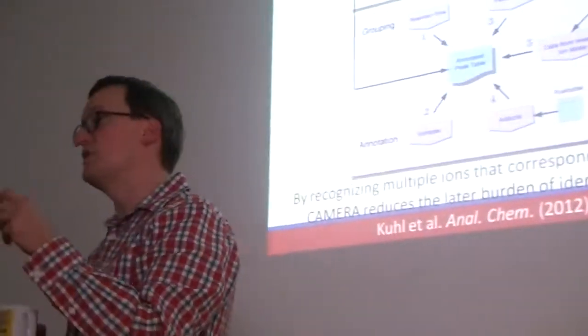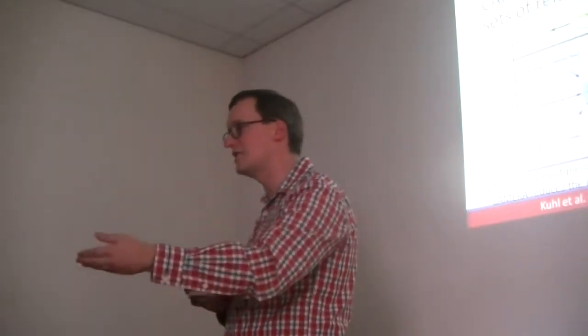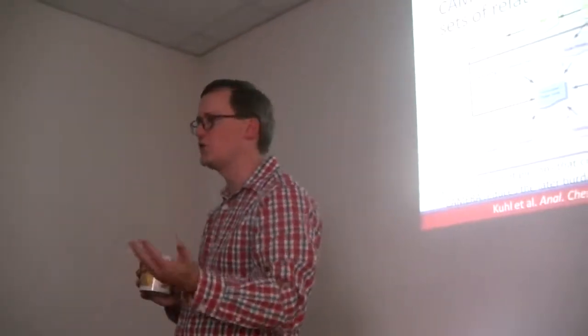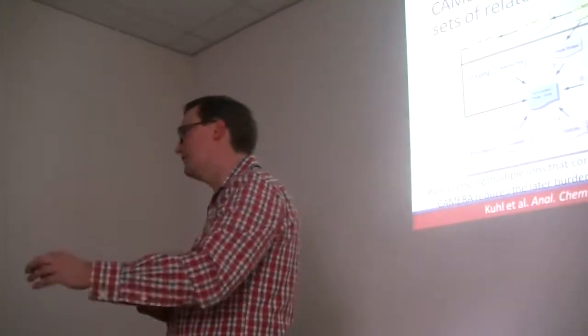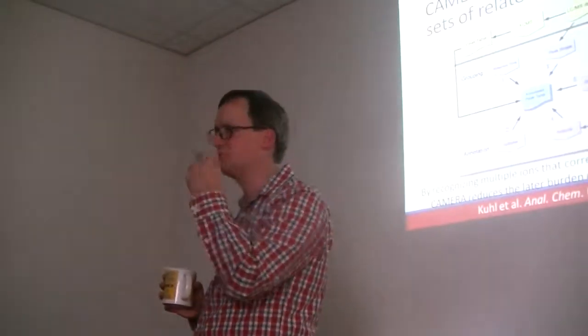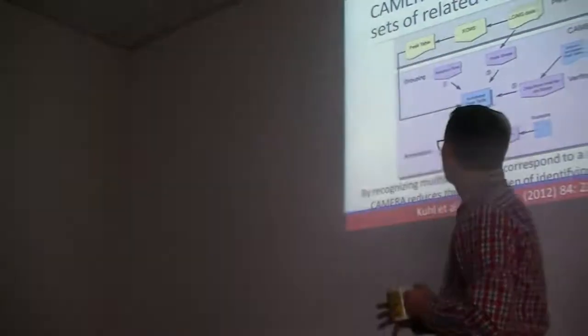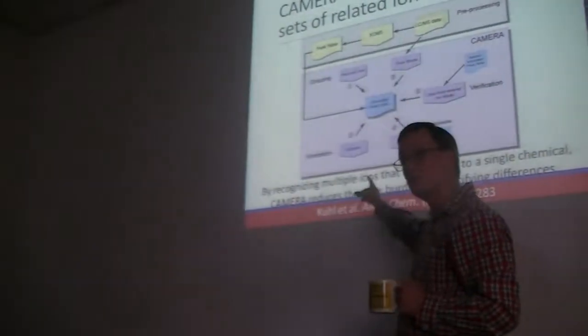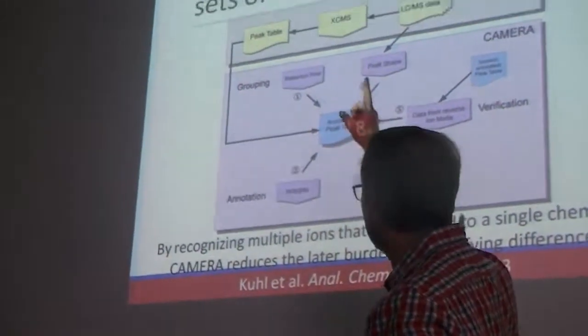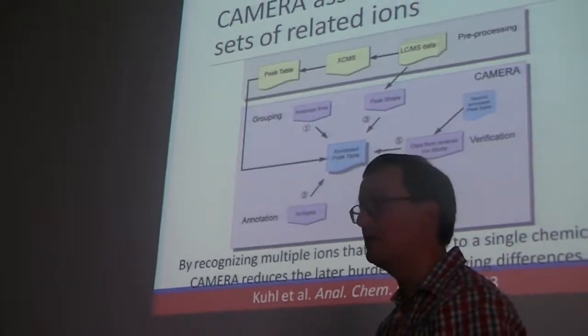In proteomics, I mentioned that you might see the same peptide in both charged +2 and charged +3 format. You may see it in oxidized form and non-oxidized form. The same thing can happen in metabolites. Maybe not always different charges, because frequently metabolites are living in this +1 world where you don't really get 2 protons carried on a metabolite. It differs by molecular class. But that means that we're going to need to group together different isotopes that belong together, different chemical variants of it as well. The CAMERA software is part of XCMS Online.